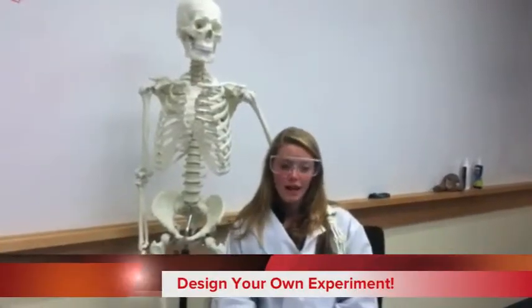This lab was designed for your own creativity. In our particular lab, we're testing the movement of the termites based on elevation, but your variables can be testing moisture and how they respond to that, or temperature, and have one part of the petri dish be hot and one be cold. It's up to you.